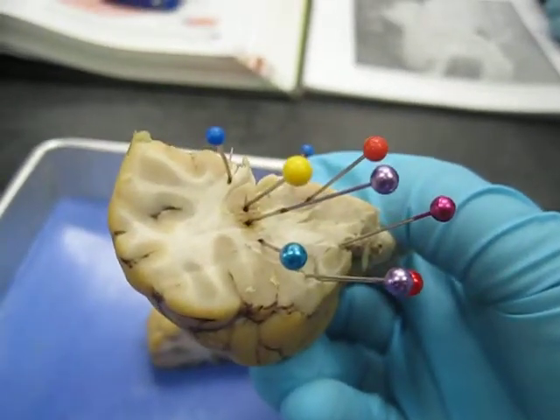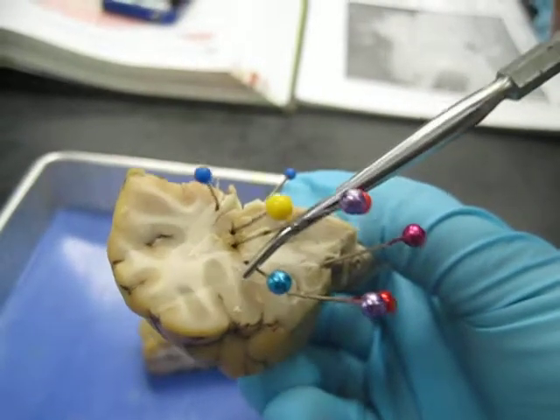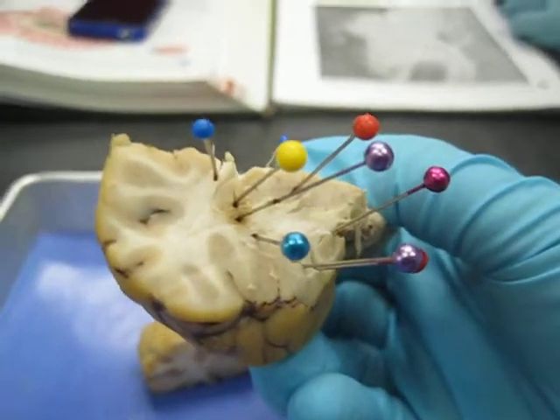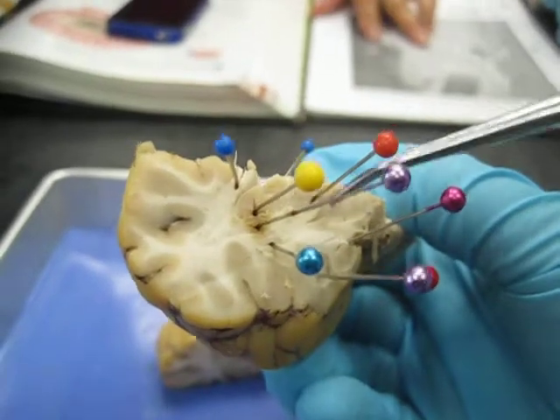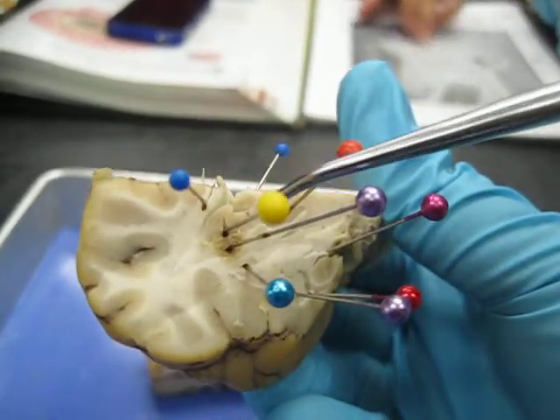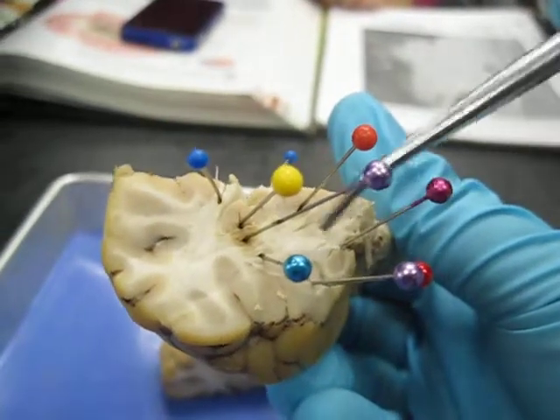It's not pinned. I guess it could kind of be the blue pin. You have the globus pallidus and something. Just know it's the lentiform nucleus. That's all you need to know. Lentiform nucleus? Yeah. So there are 2 nuclei. The caudate nucleus is next to the lateral ventricle, and then the lentiform nucleus is kind of away.